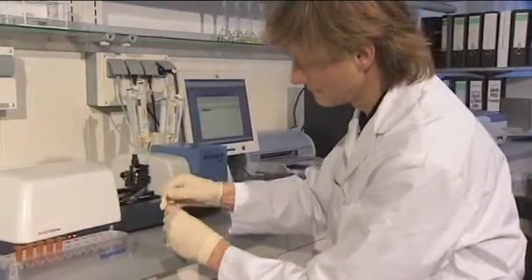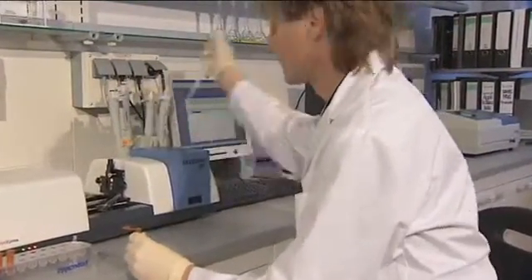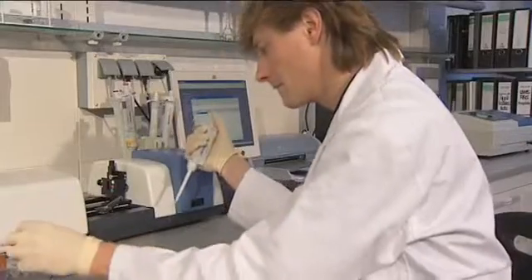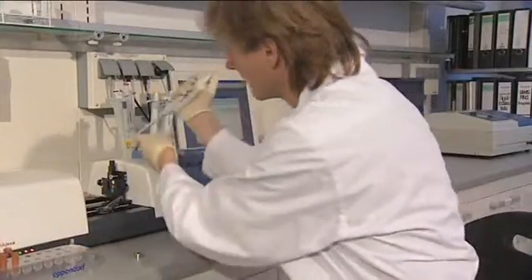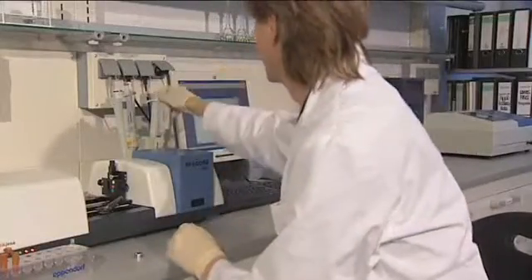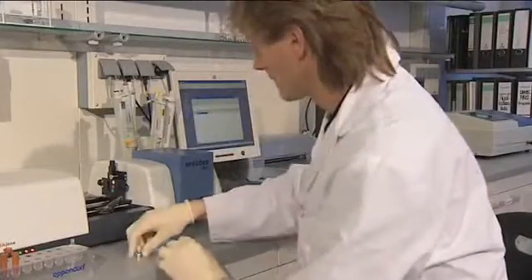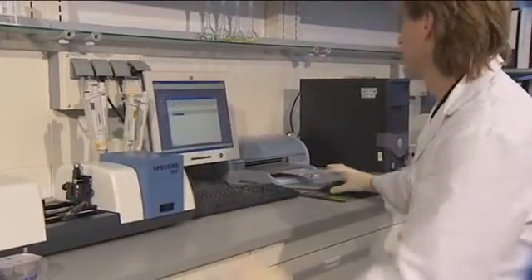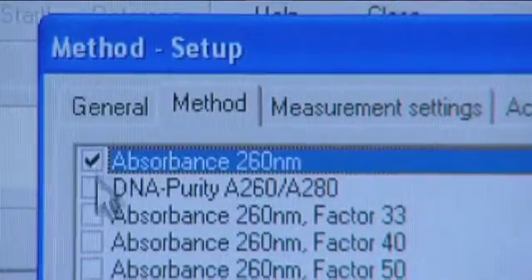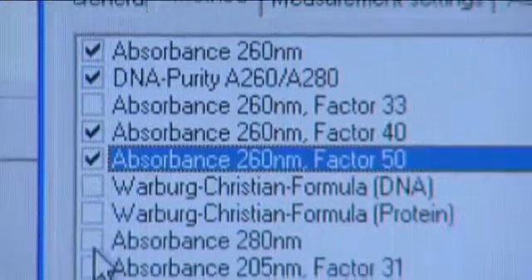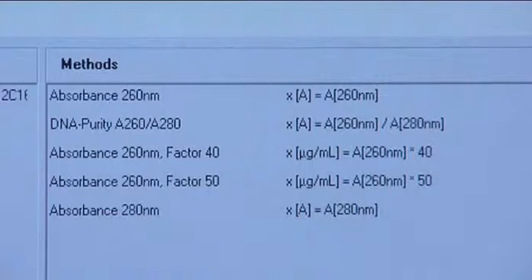The Spicord S600 is ready to use for determination of DNA, RNA, and proteins in small sample volumes with a module for biochemical analysis. There are pre-programmed methods for DNA concentration, DNA purity, Bradford assay, Lowry assay, BCA assay, Biuret assay, and more.